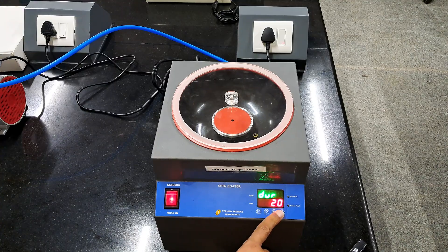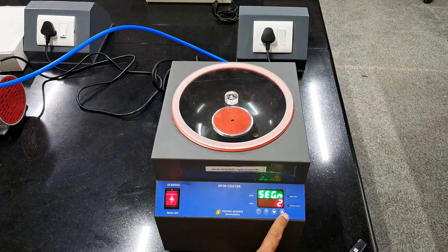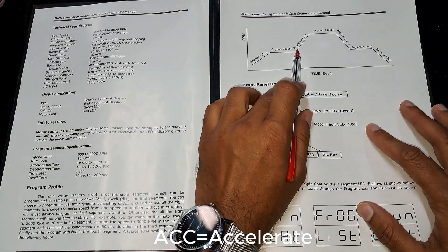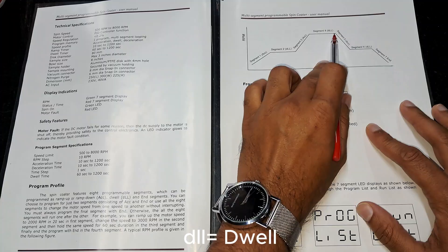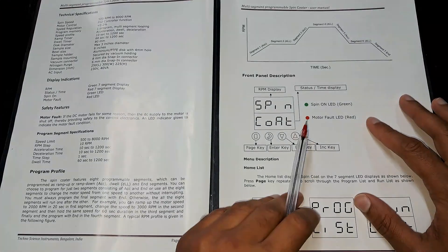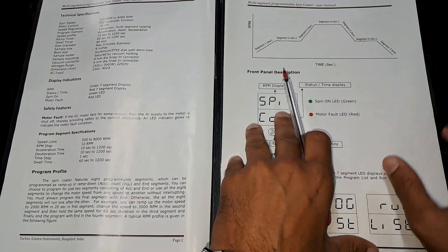The first segment is acceleration, second is the dwell which means constant speed, third one is acceleration, fourth one is dwell, fifth one is deceleration, dwell and deceleration.